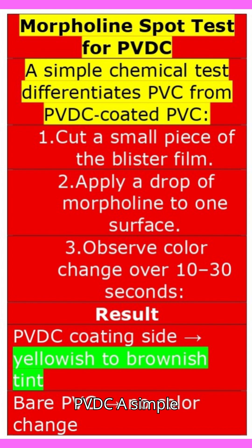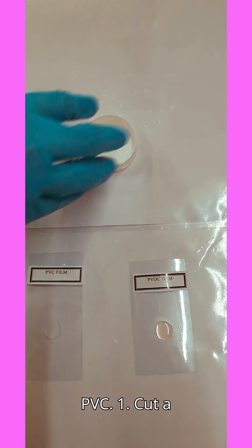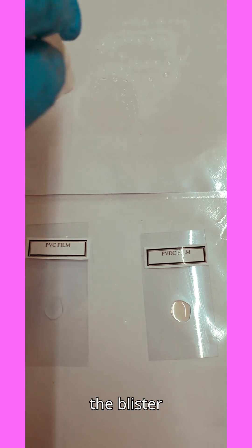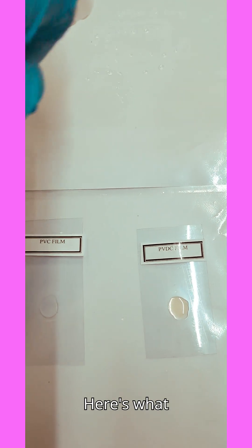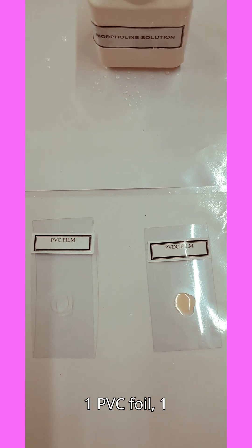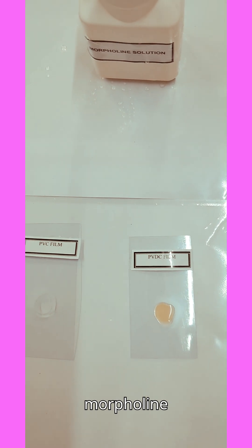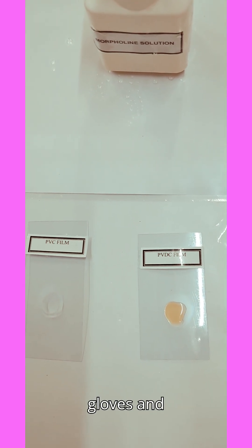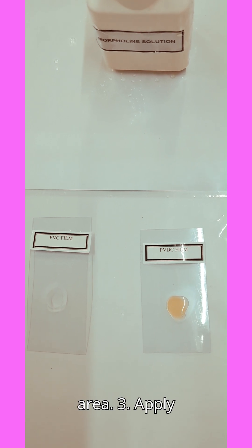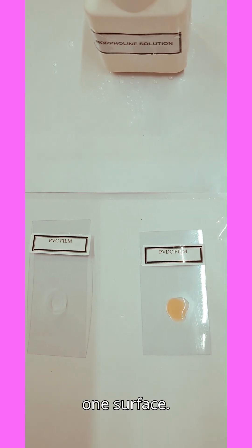This simple chemical test differentiates PVC from PVDC-coated PVC. Step one: cut a small piece of the blister film. What you need: two blister foils — one PVC foil and one PVDC foil — and morpholine reagent. Always wear gloves and work in a ventilated area. Step two: apply a drop of morpholine to one surface.